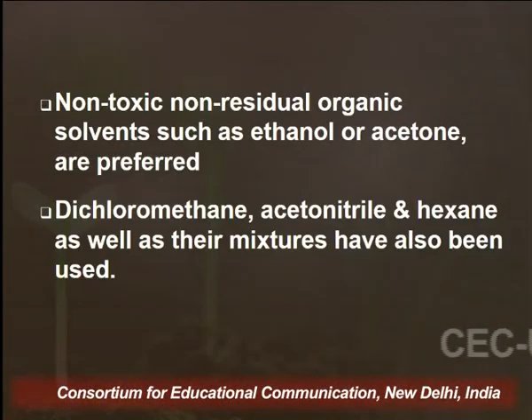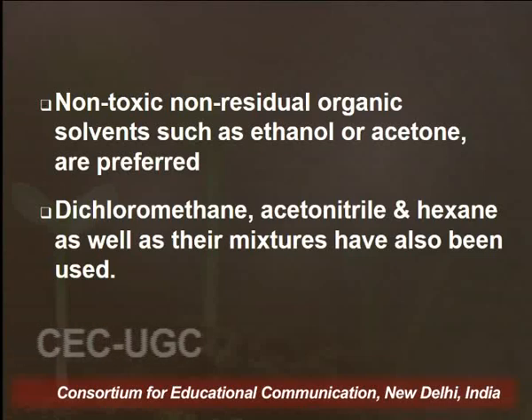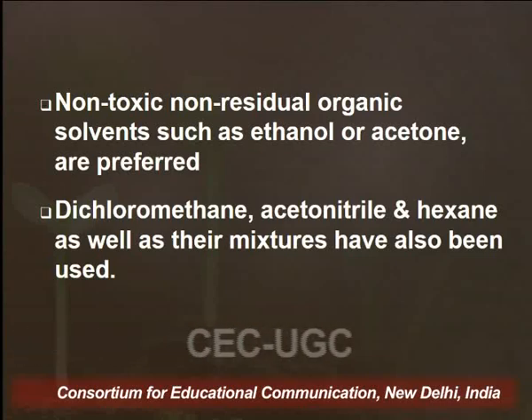Then non-toxic, non-residual organic solvents such as ethanol or acetone are normally preferred for this kind of extraction technique, because I told you that we are moving toward greener techniques, or toward the use of greener solvents which are safe for the environment and safe for the user. Therefore, ethanol, acetone, such kinds of solvents are now more preferred in extraction techniques.